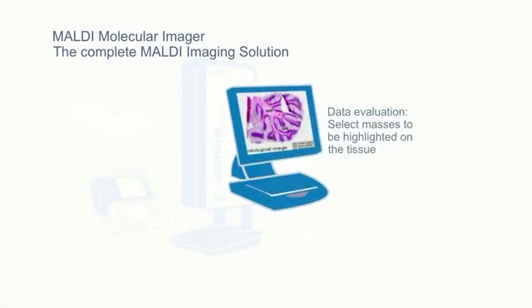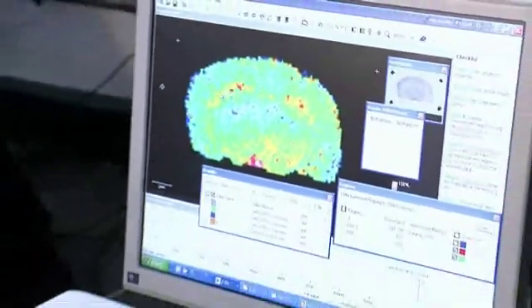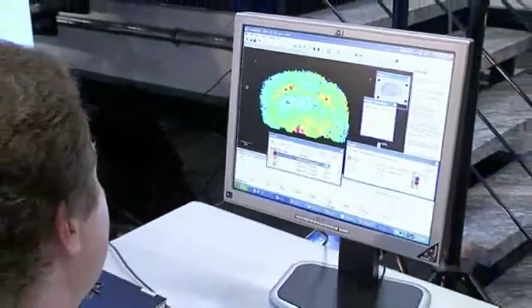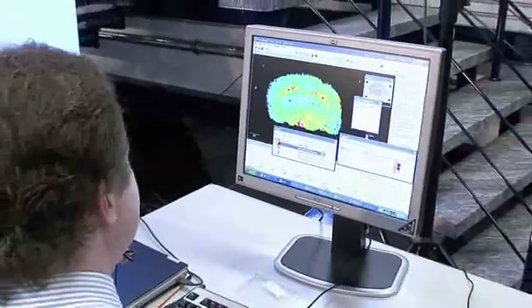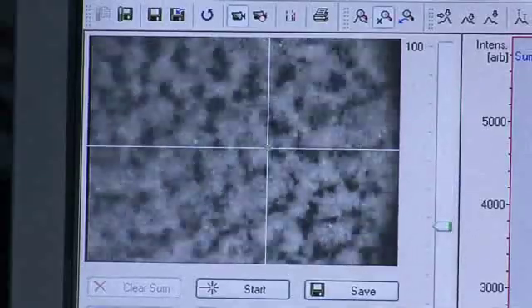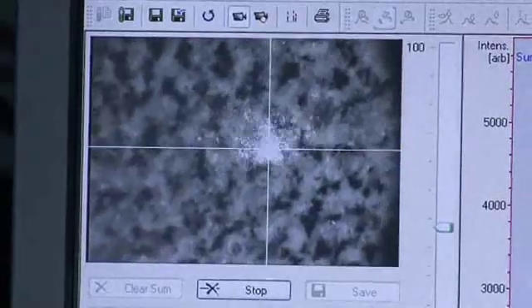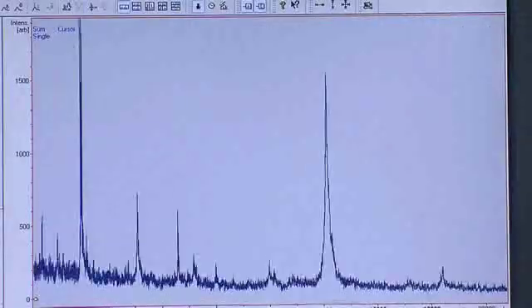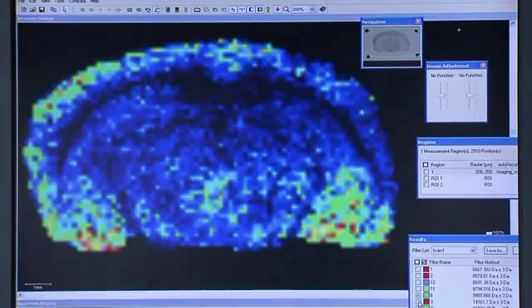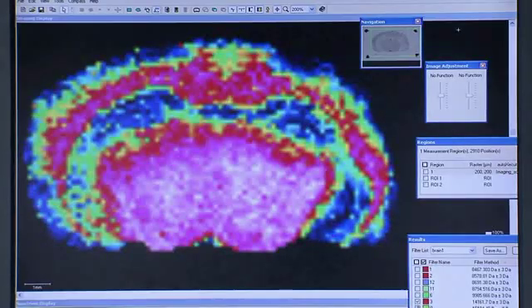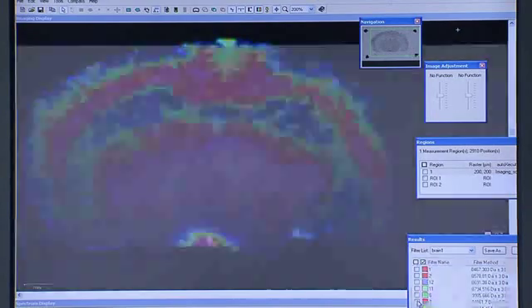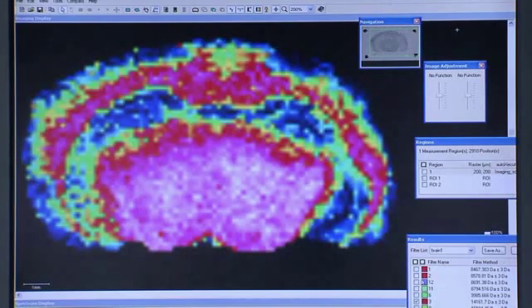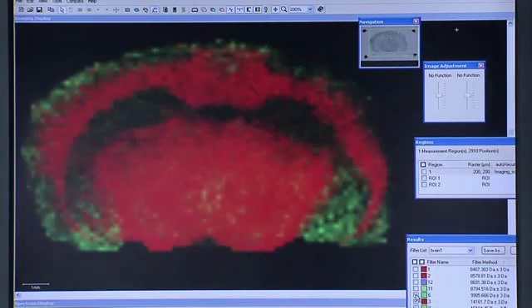Proprietary software, FlexImaging, simplifies data acquisition processes. Signals are then translated to color codes on the tissue images to represent the spatial distribution of particular peptides or proteins.